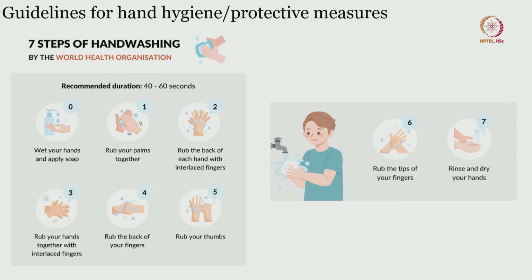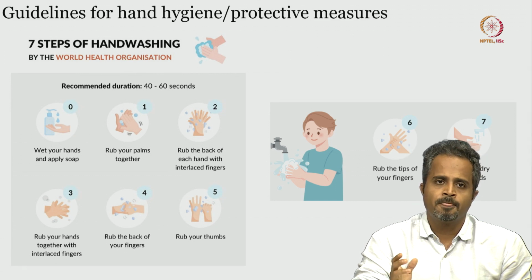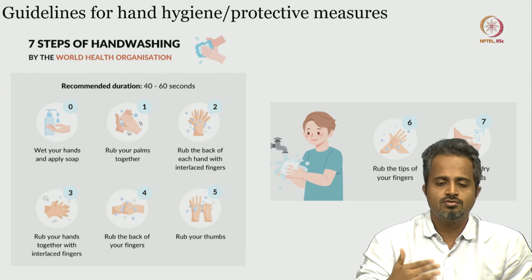You need to have an assistant, and I would prefer to have a person who can help you with the transition from the unsterile to sterile. It is always good to have, and you can help each other in those particular steps where you switch from unsterile to sterile.